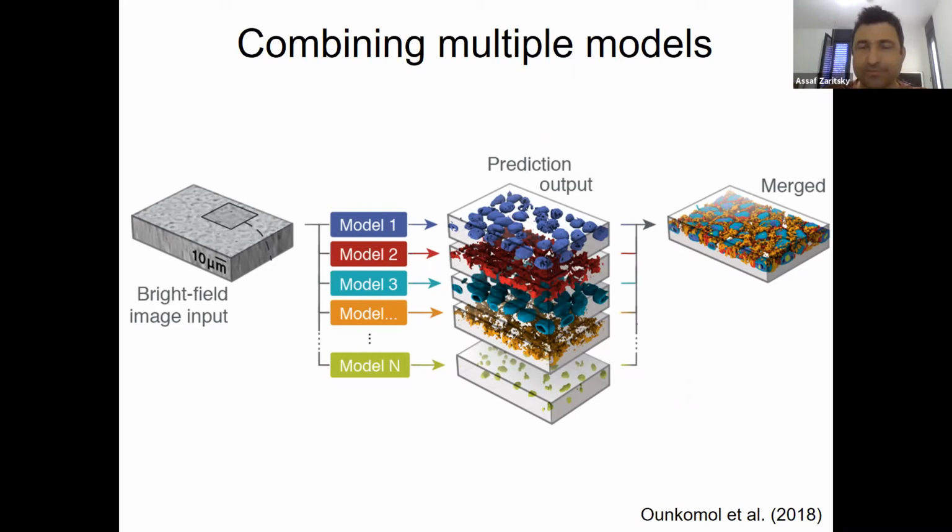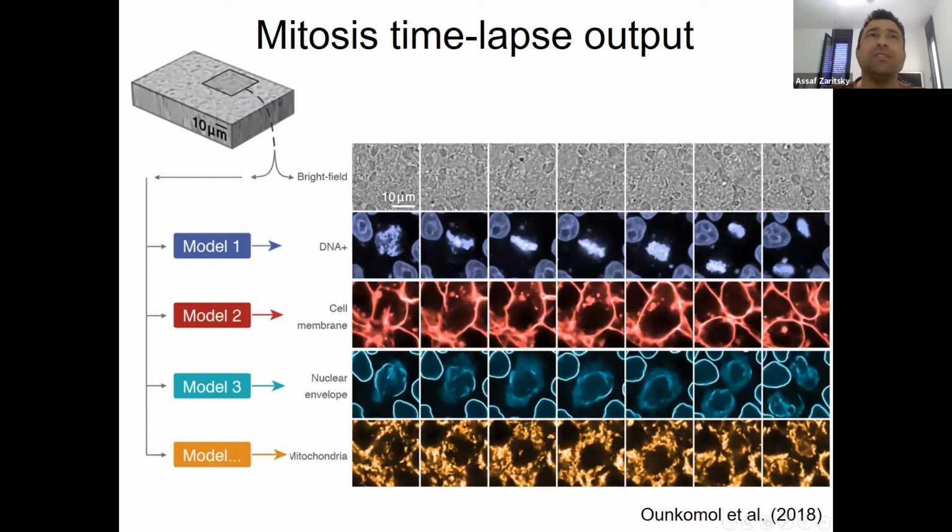And now once we have it, here is an example. What you can see here is a dividing cell. You can see the DNA splitting from one to two. You don't see a membrane going between the cells. You can see very clearly a cell dividing. And when we look here, we can actually see the two cells, but it's really hard.